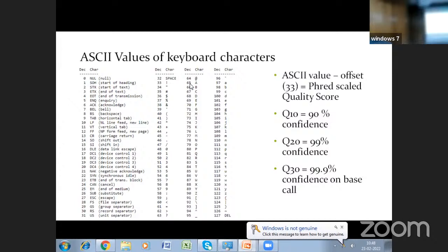If the enrichment in library preparation is perfect, there won't be any issues while sequencing. The only issue will be when the reagent runs out; at that point you will not be getting good quality reads. That's why we use a bioinformatics approach to clean those things. We keep only good quality reads, so that your results do not contain false positives. You might lose some good reads too, but whatever results you have will be true positive results. Okay? Yes, please go on.